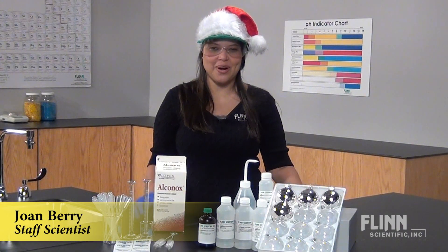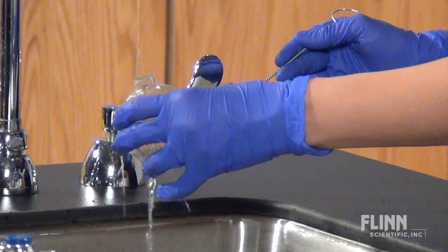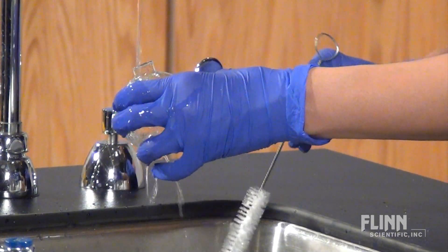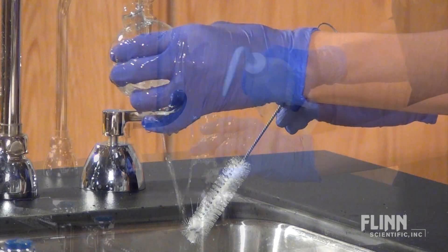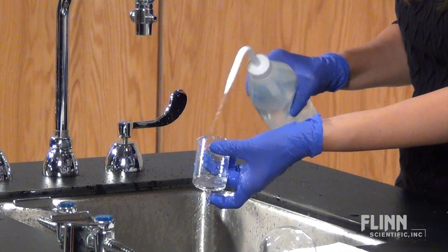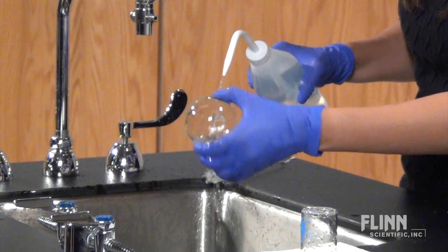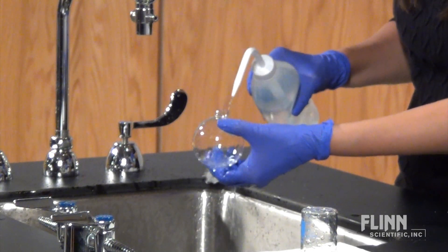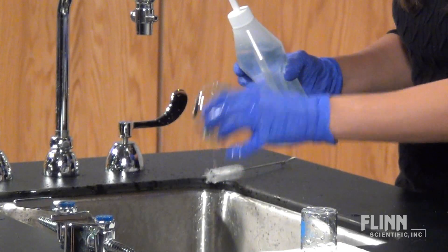Create the perfect silver ornaments this holiday season in your lab. First, it's important to clean the glass ornaments and glassware you will use with soap and water. Rinse everything with distilled or deionized water to ensure that residual ions, which may interfere with the redox reaction, do not remain on the glass surface. It is important that the glassware be very, very clean.